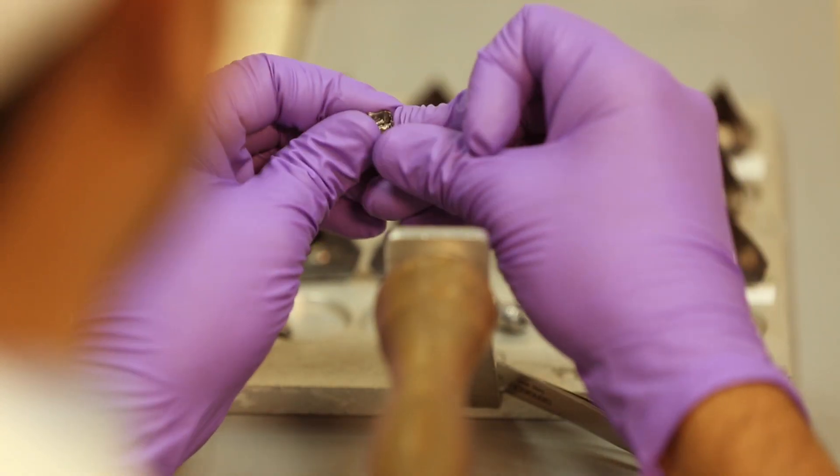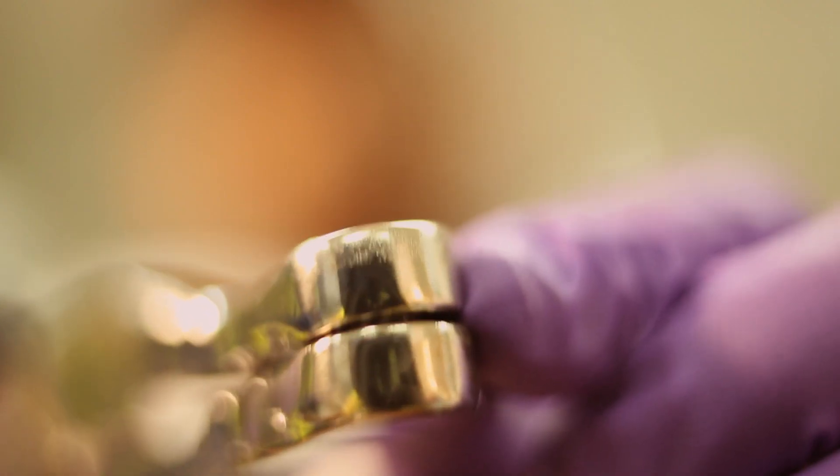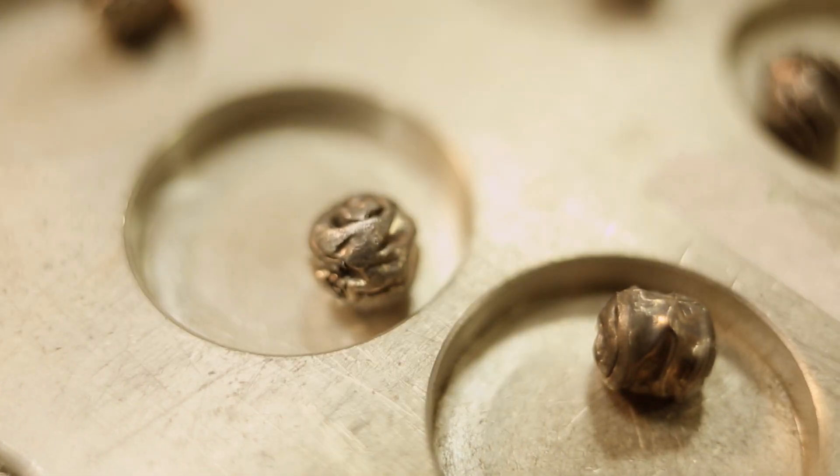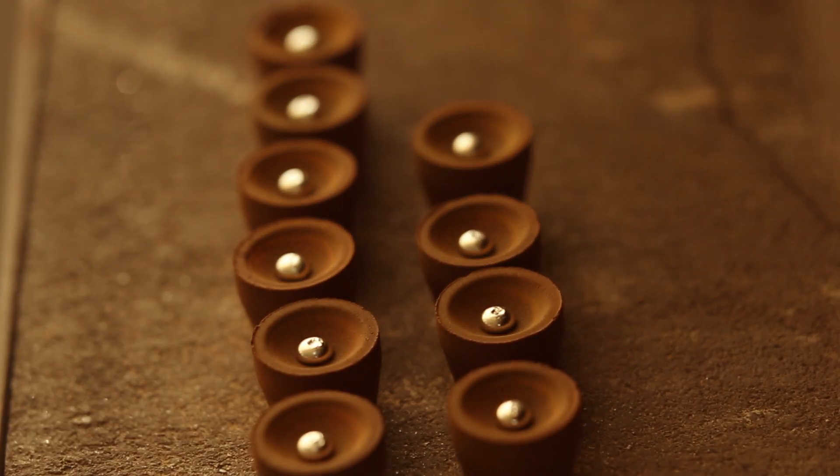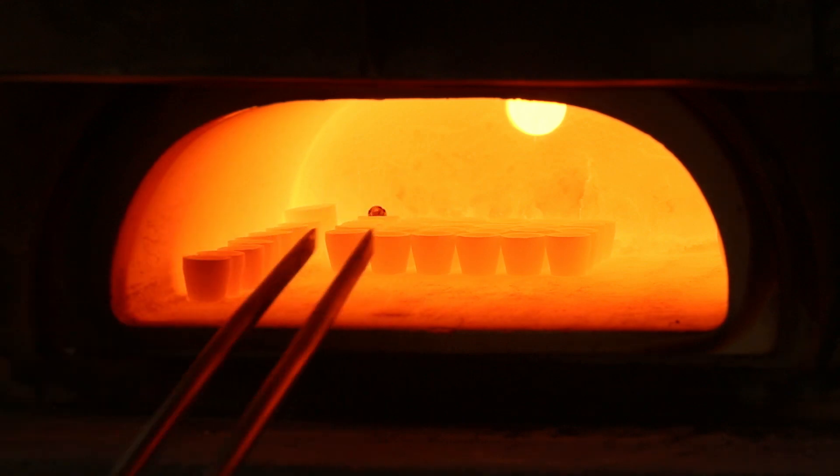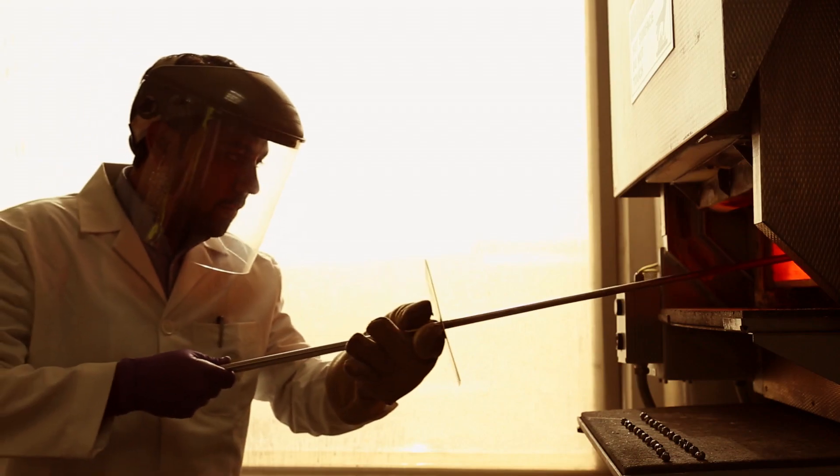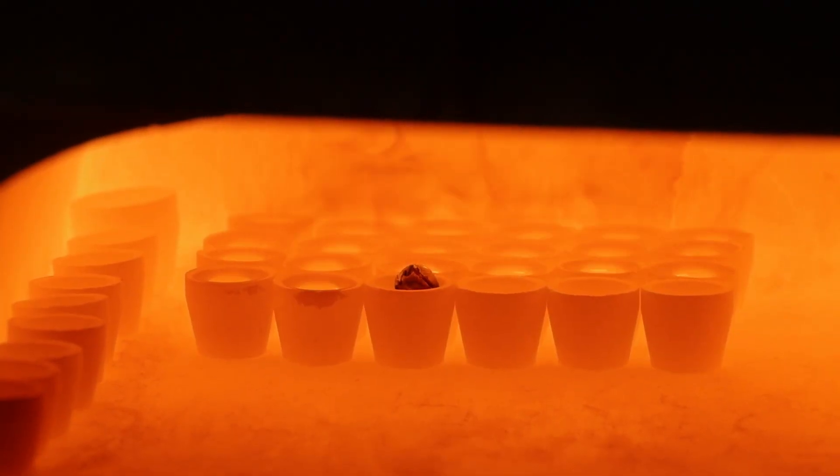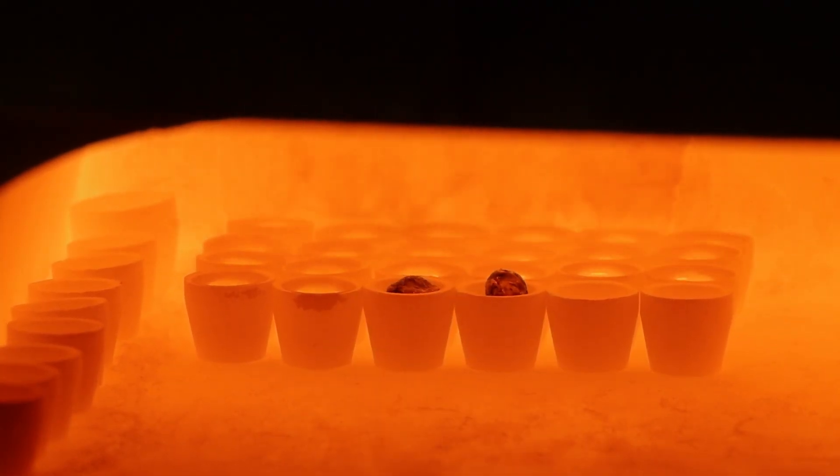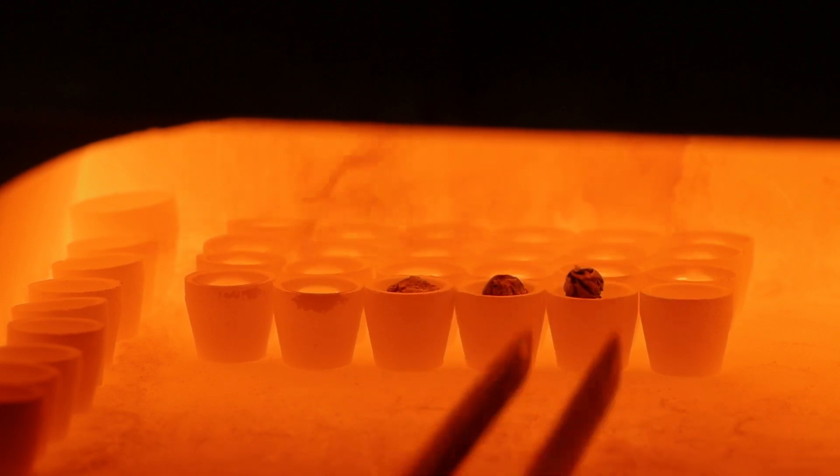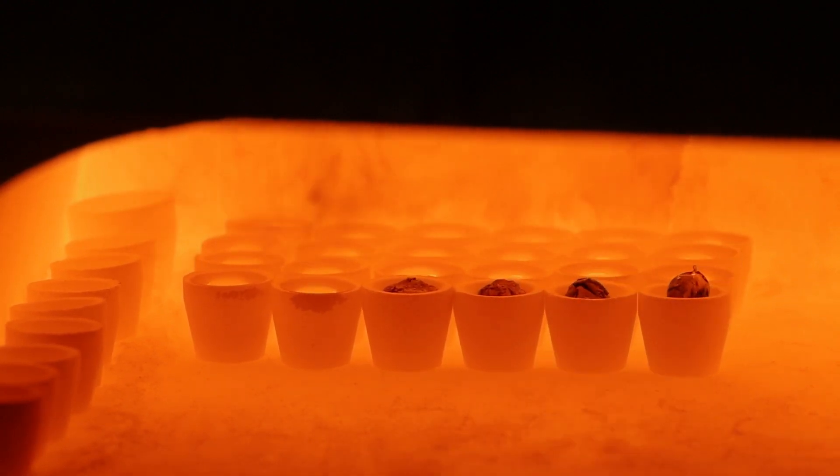They are then wrapped in lead foil and deposited into preheated shallow porous containers called cupels that are placed in a cupelation furnace of a desired set temperature. The base metals present in the sample get oxidized, leaving behind just the precious metals.